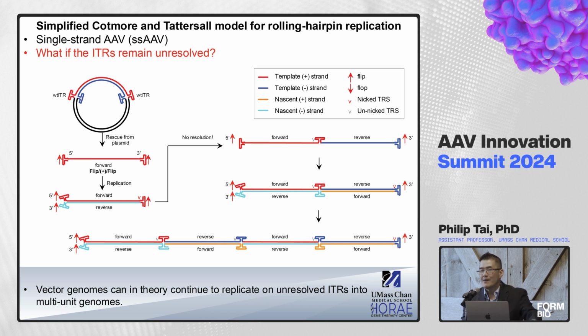ligation events that may be happening in library prep stages, right? I'm not saying that they don't happen, but if you do this A-tailed adaptering, right, that should limit this fragment-to-fragment annealing of your libraries, right?